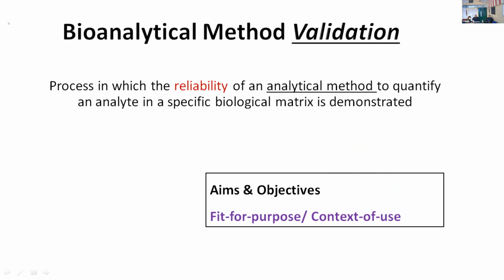So after having an explicit understanding of the basics of HPLC and method standardization, let's go further. We'll now understand what bioanalytical method validation is. Let's understand what bio means here, why we call it bioanalytical. Bio means that the matrix where you need to identify or analyze the molecule of interest is of biological origin. So it could be blood, urine, CSF, any component of biological origin.